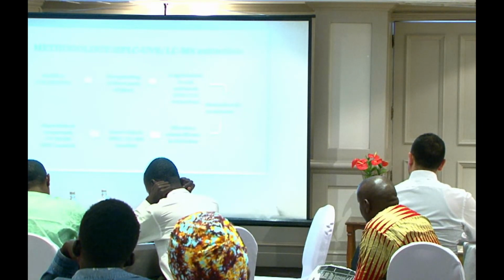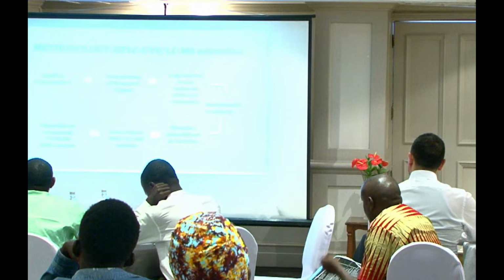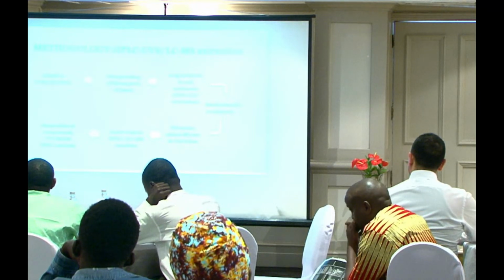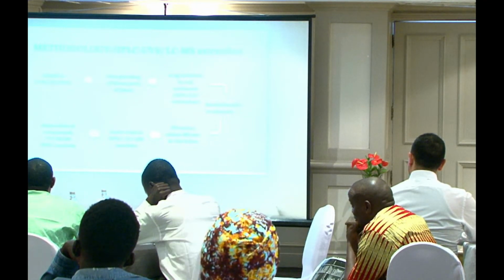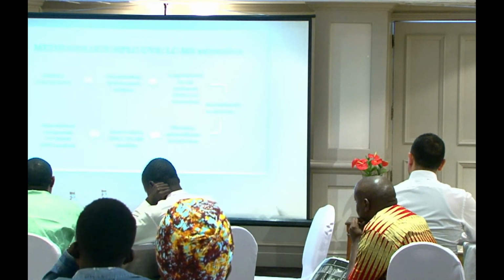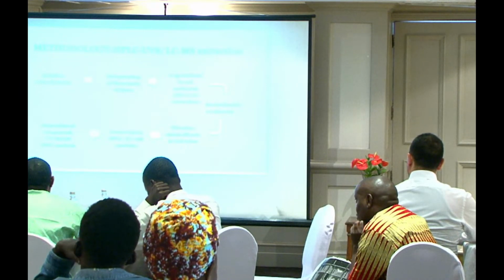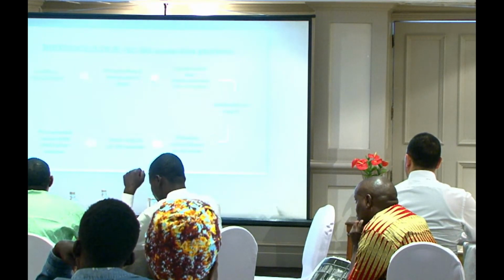That's for HPLC and LC extraction, and also for HPTLC. The next thing was sonication, followed by centrifugation, filtration, and then inserting into the HPLC and LCMS machines. Then separation occurs and you do your analysis.